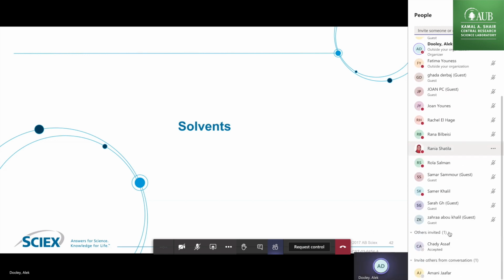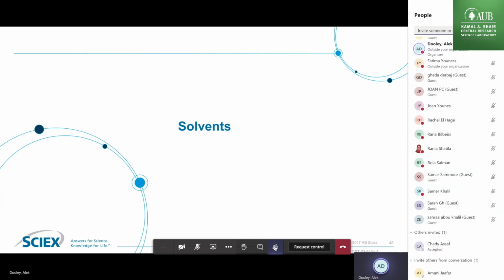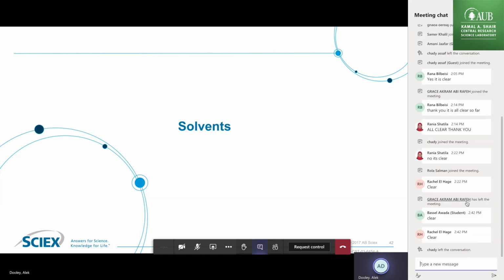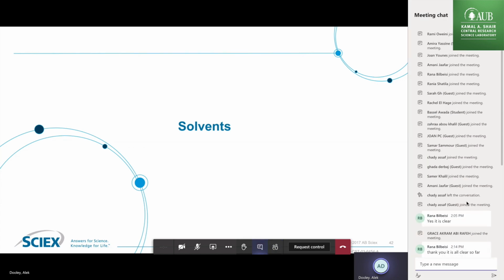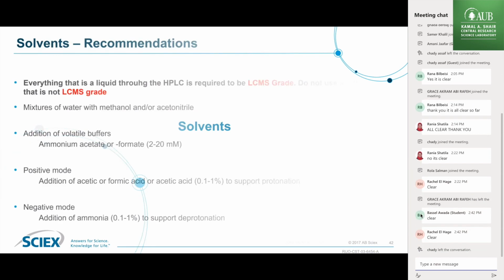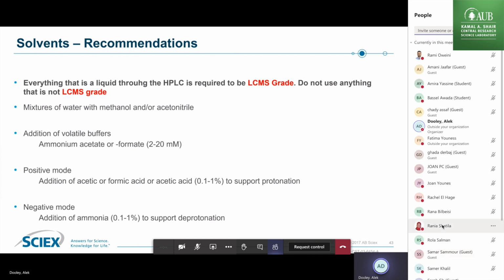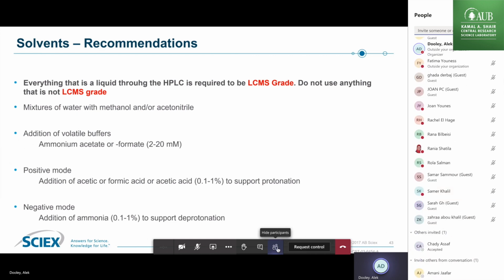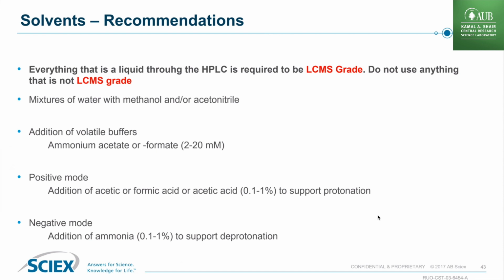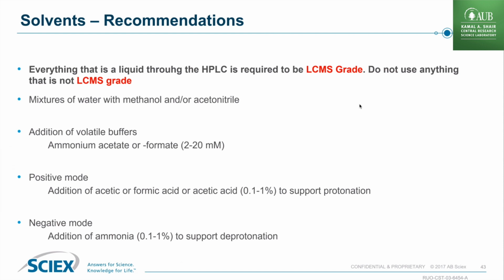All right. So now we will talk more about the hardware. The first point is the solvents. I cannot stress enough how clean the solvents need to be. On this instrument, it is required that the solvents that you use are LCMS grade. And we kind of already understand why, right?